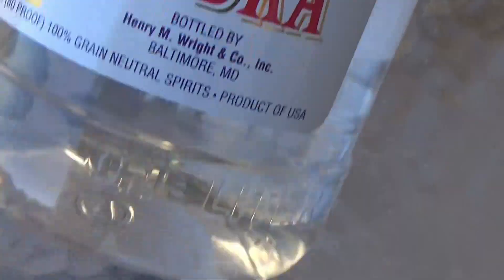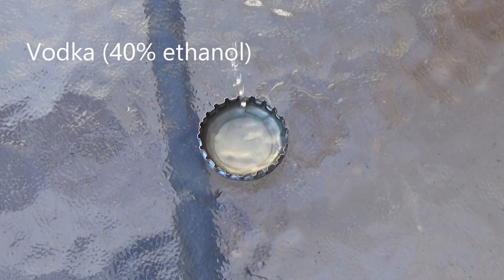Next, let's see how lithium reacts with vodka containing 40% ethanol.